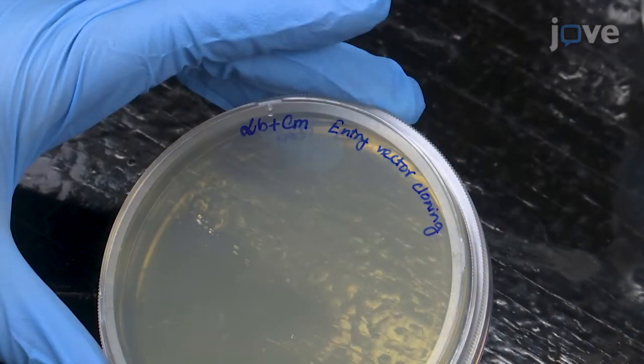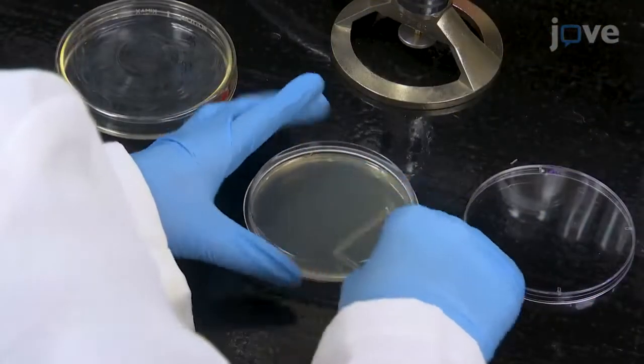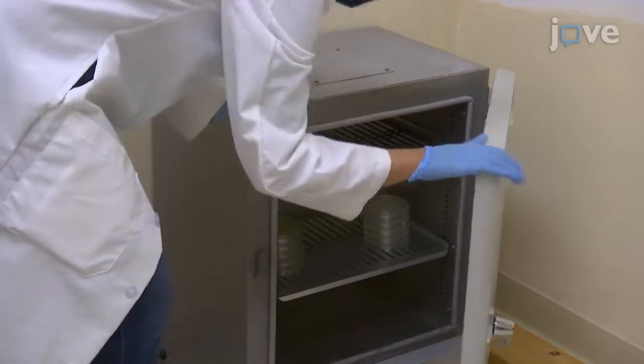Spread the cells on an LB plate with 35 micrograms per milliliter chloramphenicol. Then incubate the plate at 37 degrees Celsius overnight.